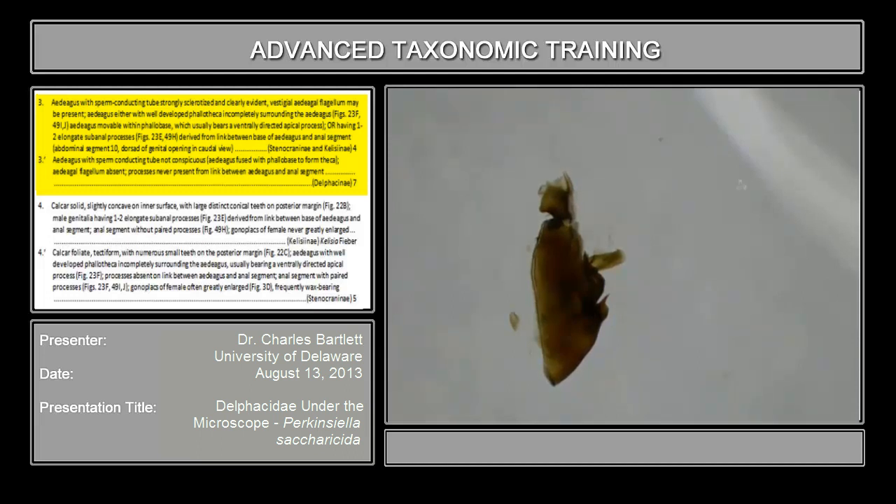If the sperm-conducting tube were evident, what we would see is a dark tube in the middle of this. But we don't see that. Continuing on: vestigial aedeagal flagellum — something very similar to what we saw in the Cixiidae — a bit off the end of the aedeagus. It may be present, but there is no flagellum here. Aedeagus either with well-developed phallotheca incompletely covering the aedeagus — but in this case we have a uniform structure. We do not see a sperm-conducting tube. We do not see the phallotheca separate from the aedeagus. We have just one uniform structure.